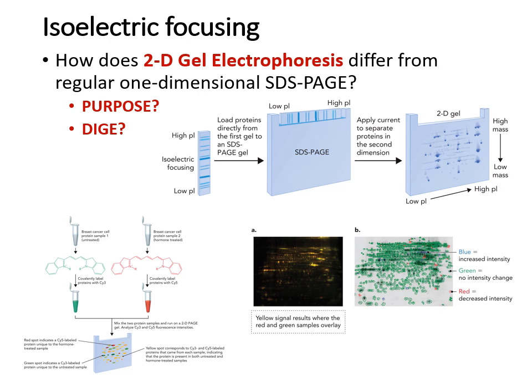Okay. And just in case you ever see the term DIGE over here, that just stands for 2D differential in-gel electrophoresis. Okay, but again, we're not going to go into the details of these. I just wanted you to know that this exists and that it gives you a greater resolving power than one-dimensional gels, and for you to know that the reason is it's combining not just mass but also isoelectric point analysis.